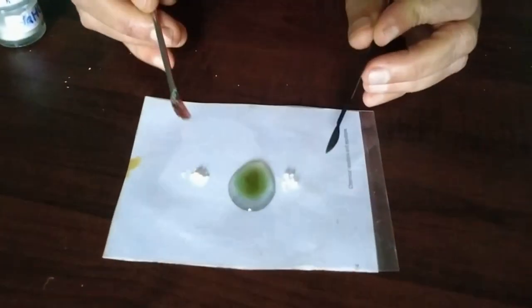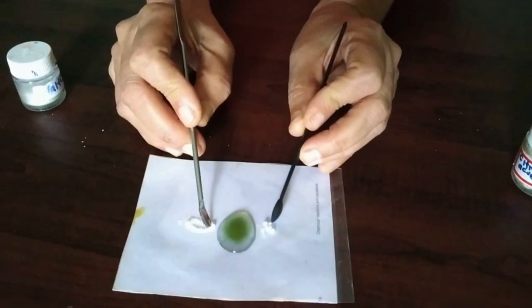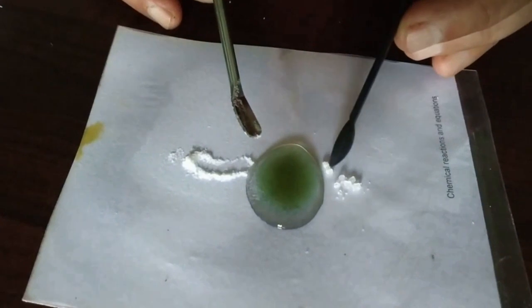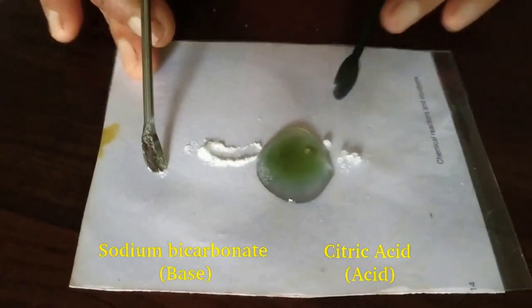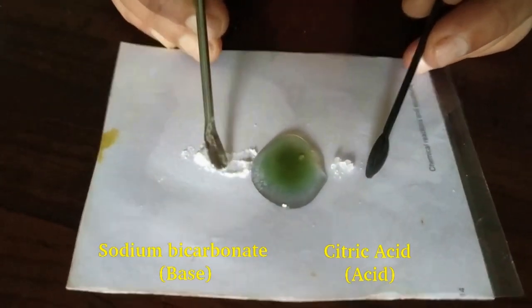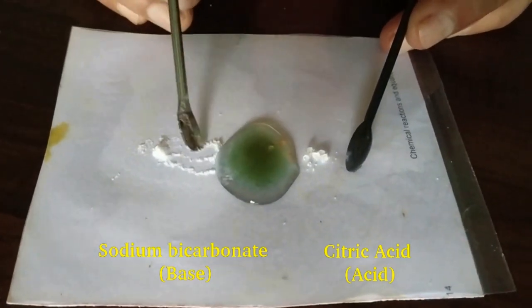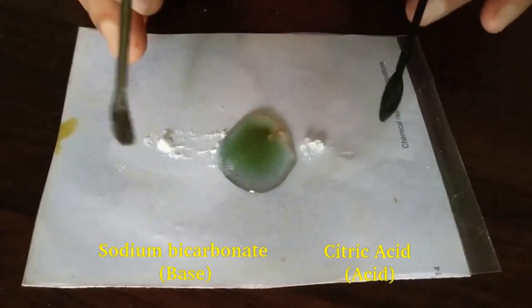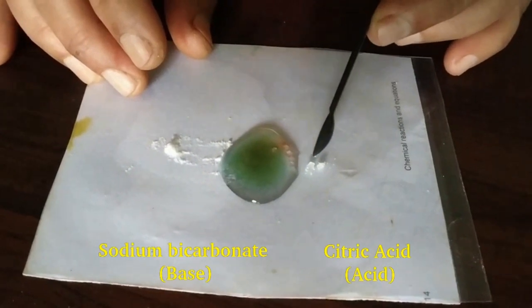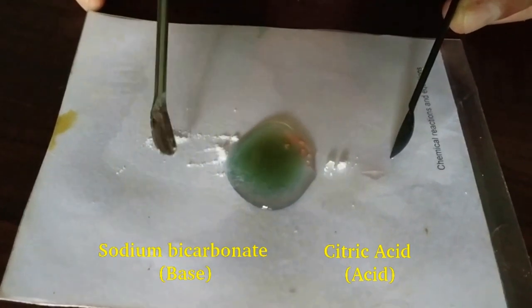Take the spatulas and slowly push these chemicals into this water. To my left side there is citric acid. I am pushing that into water. And to my right side there is sodium bicarbonate. I am pushing that into water. These two chemicals will dissolve in water and then start moving towards each other. At the point that they meet, the reaction will take place.